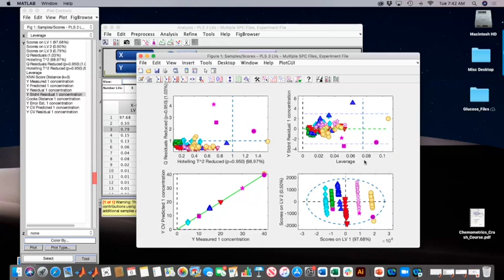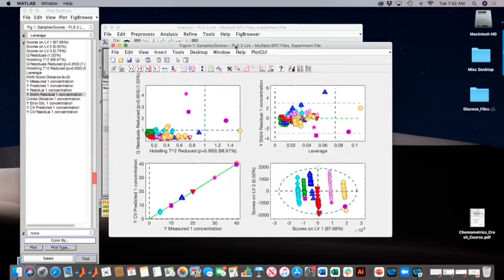At any rate, you can see that the ones that I selected here are the ones that tend to be at the ends of these groups, a little bit split off. That one, that one, that one. So it may be that I want to actually get rid of some of those samples. So I'm going to start by doing that.